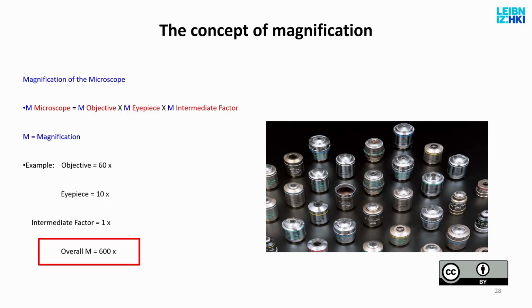So during the homework, you will probably have to do this to look up lens properties based on when I tell you, okay, size 63x, plan apo or whatever. You look it up, and from that you figure out a lot of properties of the objective.